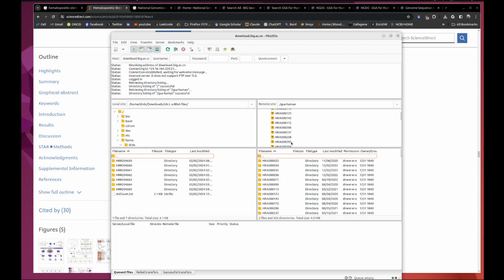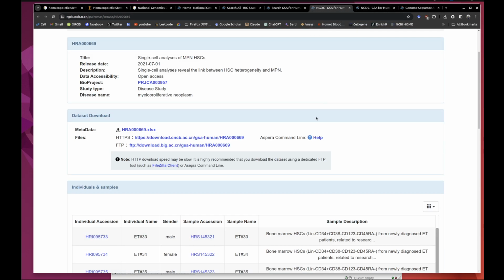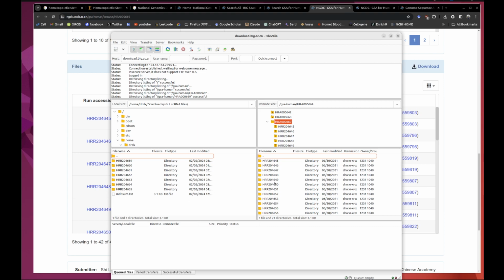So we go for HRA000669. Now these are all the files. If you see 204645, let's compare. As we have done double confirmation, now it's time to download it. You just click on this and say, okay, just download.